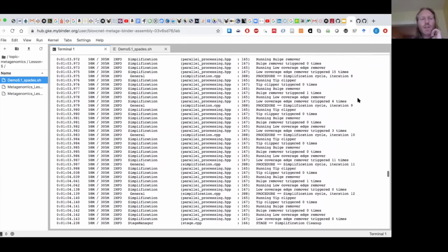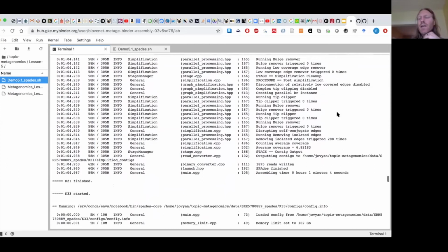And that's one thing I should emphasize, is that any assembly that you do using raw reads is best thought of as a hypothesis rather than the truth. There are a lot of possibilities for misassemblies where you have chimeras, especially in metagenomic assembly, where two different genomes maybe share a small stretch of k-mers and they get misassembled together into one long contig that is actually a bad estimate of what is actually in the environment.